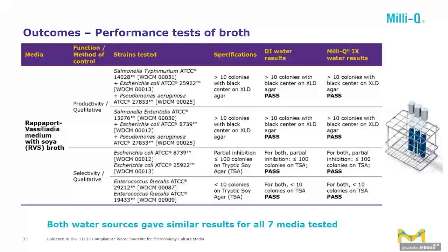So this is what, for example, a system might look like. It delivers water that answers all the requirements of the standards: low conductivity, low microbial count. There is monitoring, and the water is freshly purified or stored in a tank that is made of inert material. So this checks all the requirements regarding the water quality for sure.